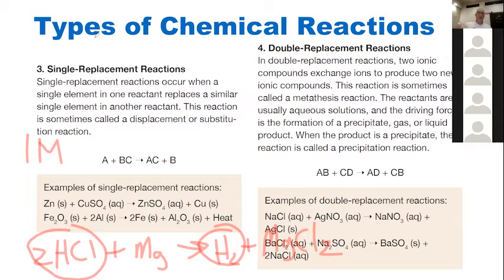Put it underwater, and as hydrogen is produced, it should force the water out of the tube until we have a full tube of hydrogen, and then we're going to blow it up. So that'll be even more fun.